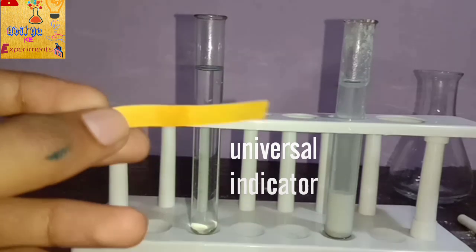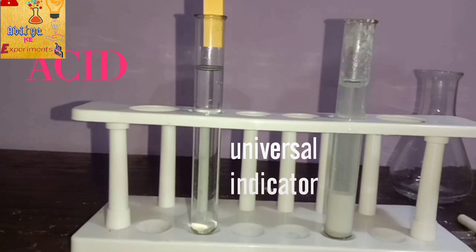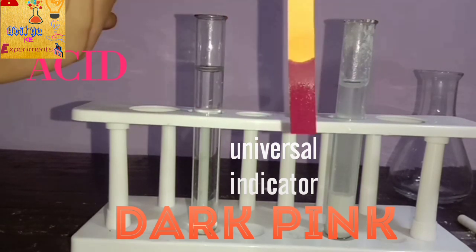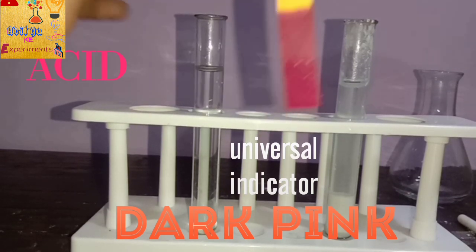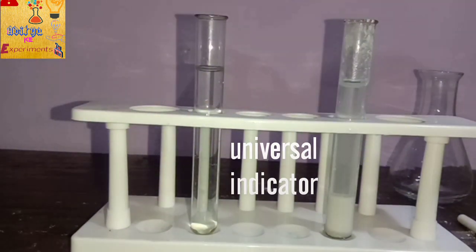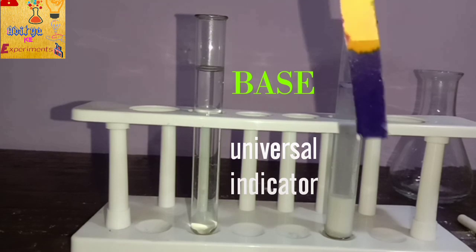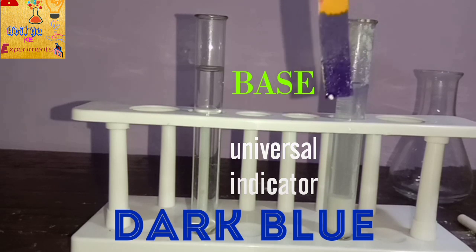Now we will check universal indicator in acid. So as you can see, the color of yellow indicator is changing into dark pink color. Now we will check the same in base. Now this universal indicator we will be checking in base. Now as you can see, the color of universal indicator is changing into dark blue color. It's totally converted into dark blue.